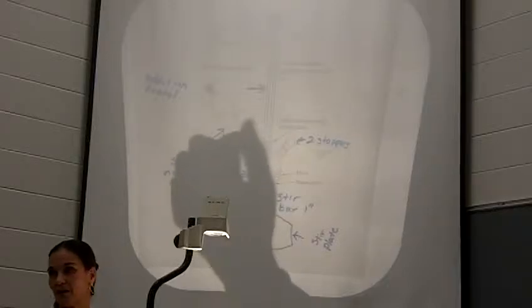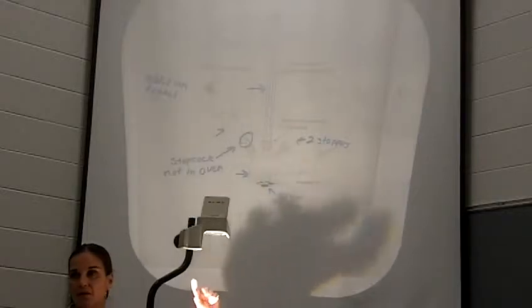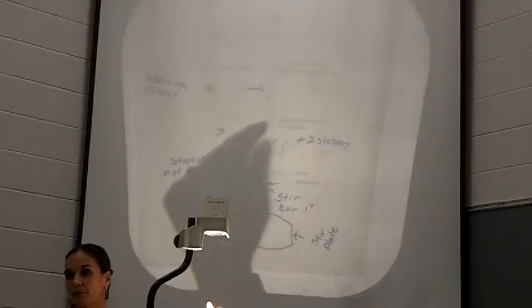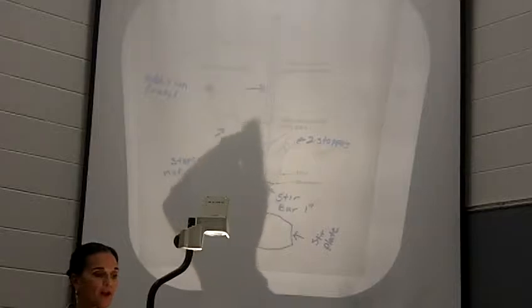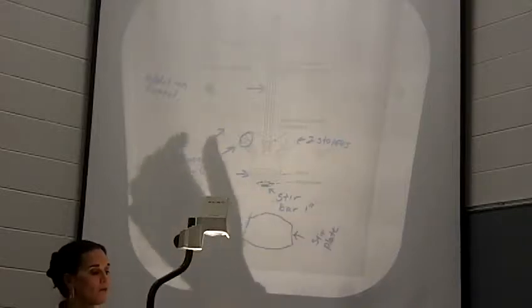Don't forget your stopcock. The Teflon pieces don't go in the oven, but when it comes out of the oven, you've got to put the pieces back together again on there, okay? And then make sure, remember with stopcock, which way is closed, horizontal or vertical? Horizontal, so make sure you put it on horizontal because you're going to start putting things in your separatory funnel that you don't want to drip in, okay?